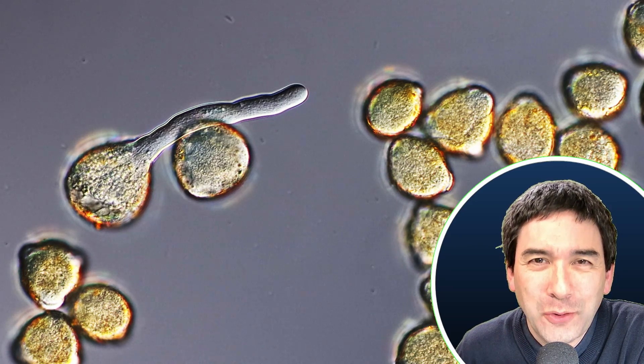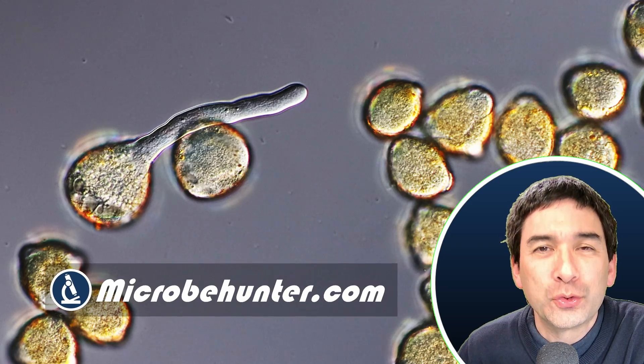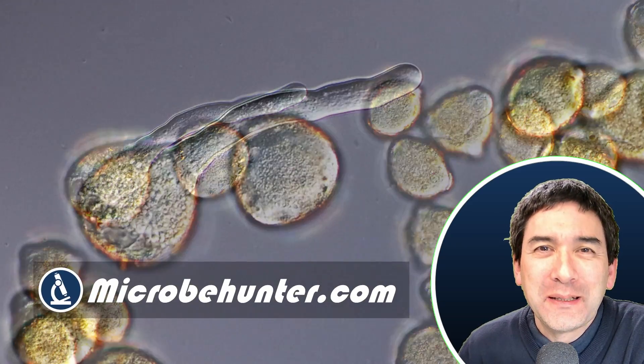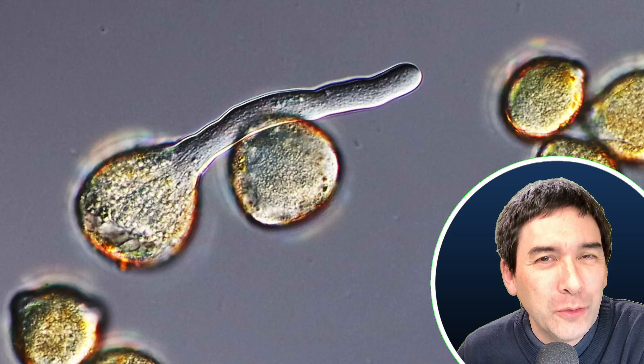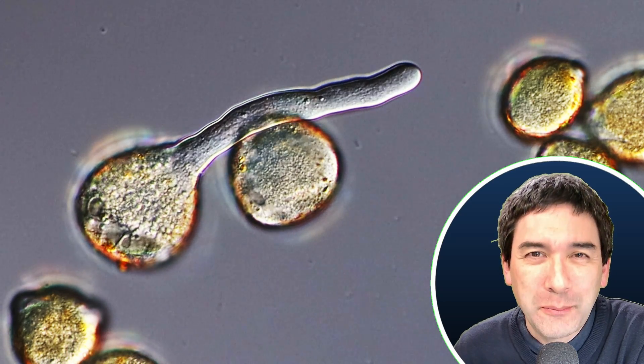Hi, hello and welcome. Microbe Hunter here. What you see here is a germinating pollen grain. I wanted to explain a little bit of what pollen germination actually is and why it is important for the reproduction in flowering plants.